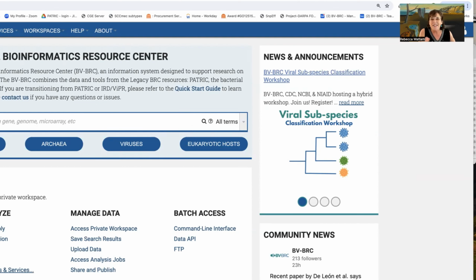And let's say you're not interested in something that big, but you've got your particular gene and you want to find the close homologs to it. Wow. Every biologist knows about BLAST, don't we? And we use it all the time to find close relatives to our genes.